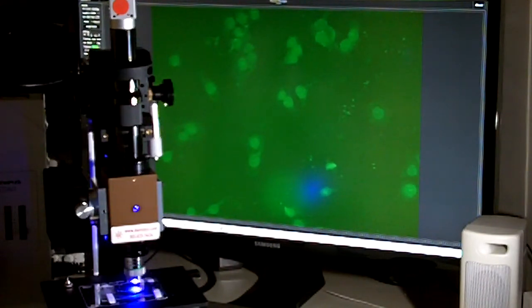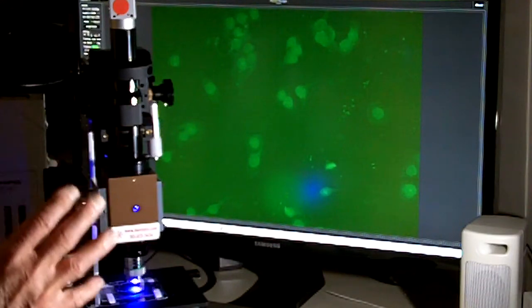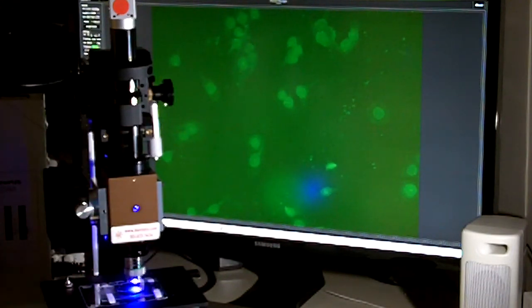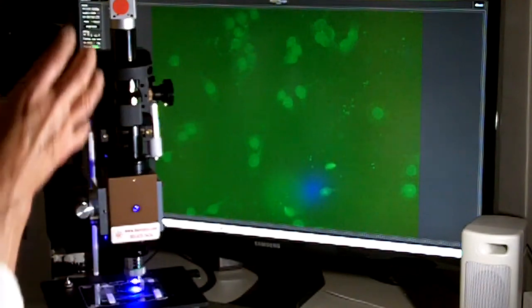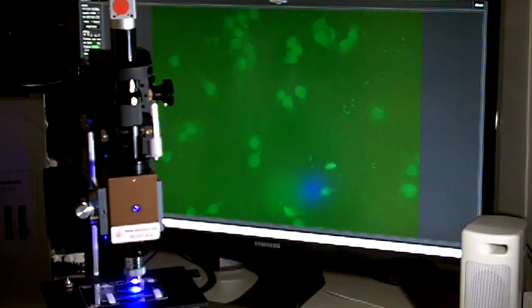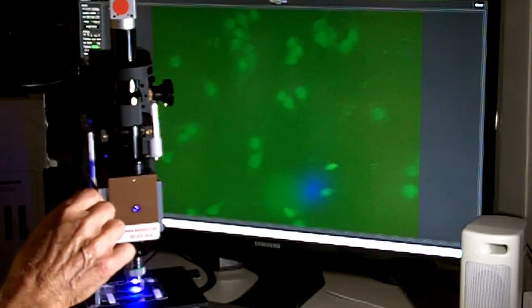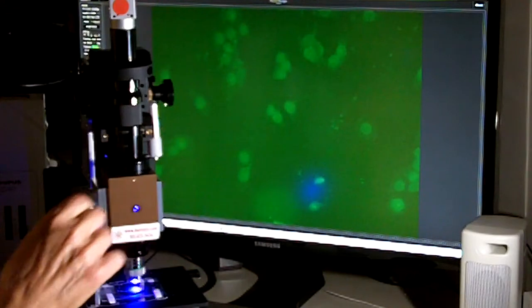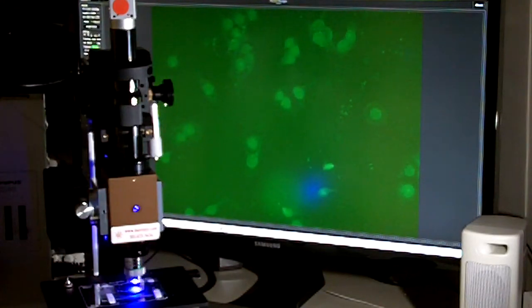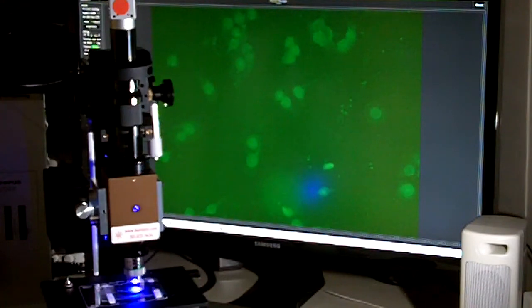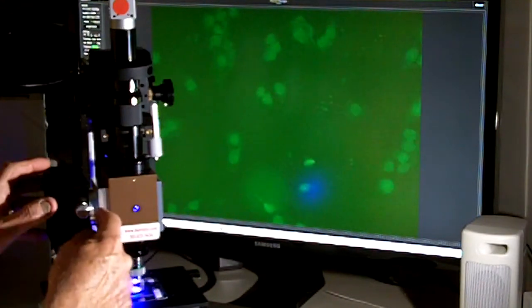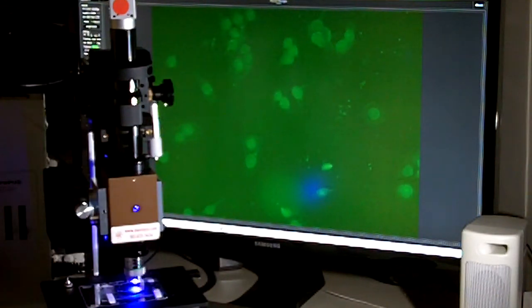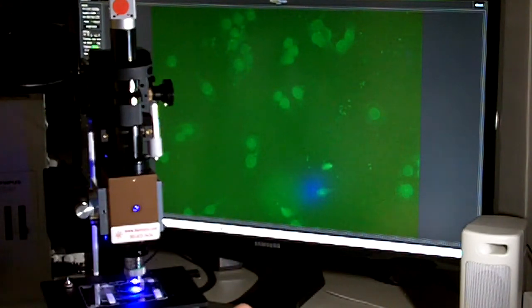So, as you can see optically, this is a very, very flexible system where we can go from macro zoom to high magnification micro. And we can do the LED illumination or if you already have a liquid light guide, metal halide lamp that you want to put to use, the lamp is quickly disconnected and you can use your existing illumination system.